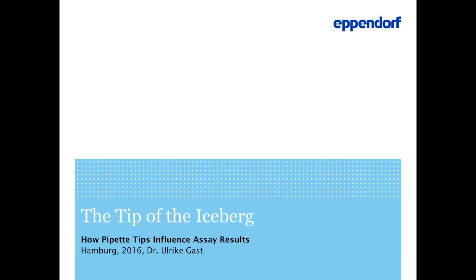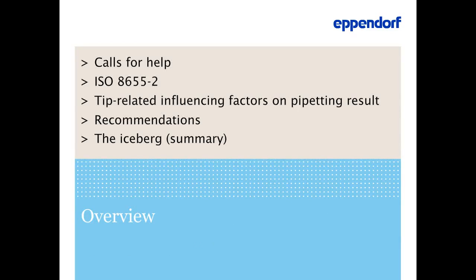Our agenda looks as follows. I'm starting with a short introduction into a widely unknown problem you might face in your lab. We are then approaching the context by checking out the ISO 8655, the standard for liquid handling. After this, I'm presenting some results of a broad study we have performed. This webinar will probably bring up some question marks regarding the use of pipette tips. Thus, I do not want to end the webinar without giving recommendations before I finish with a summary. There is some time for further questions at the end of this webinar, as you know.